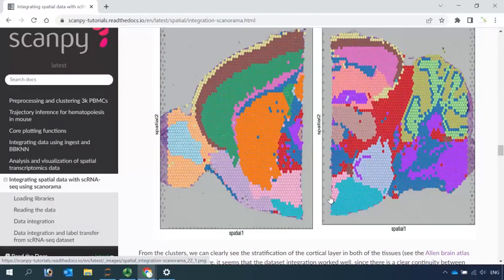You can see here, in order to connect all the spots from the brain sections for single-cell RNA sequencing data preparation, we have to separate the tissue into two parts, anterior and posterior, and do separate spot collecting for the sequencing data preparation. But thankfully, packages were developed to integrate the spatial dataset.